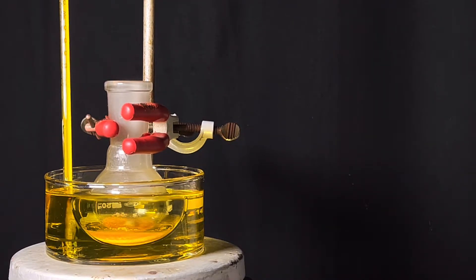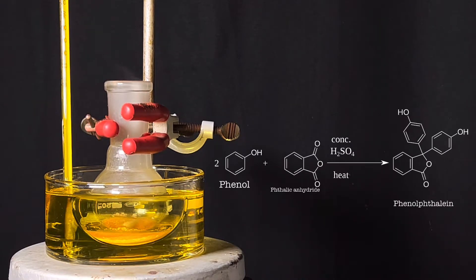While it is getting heated let us go through the chemical equation of the following reaction. 2 molecules of phenol condenses with 1 molecule of phthalic anhydride in the presence of concentrated sulfuric acid to form phenolphthalein.